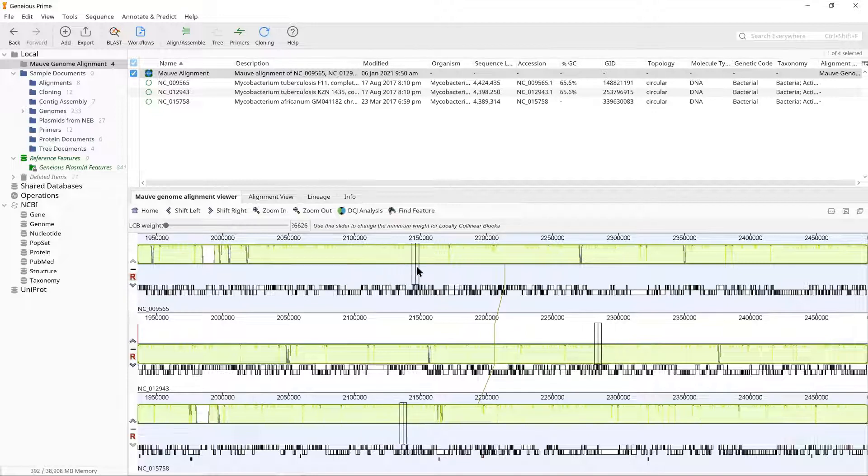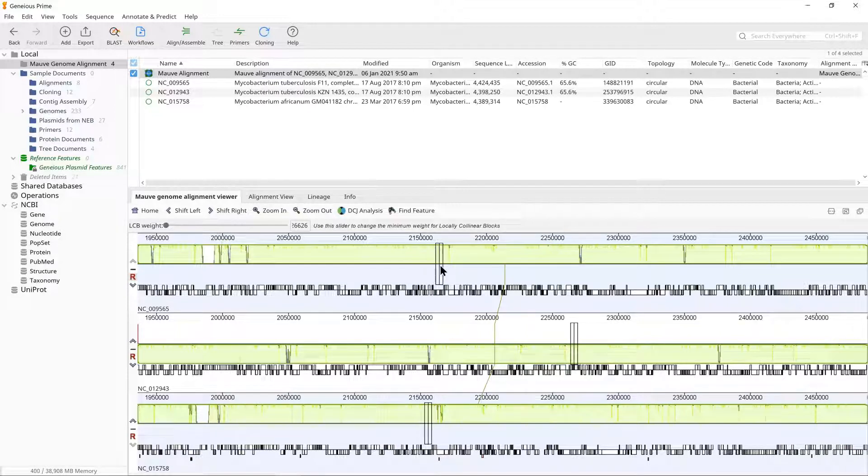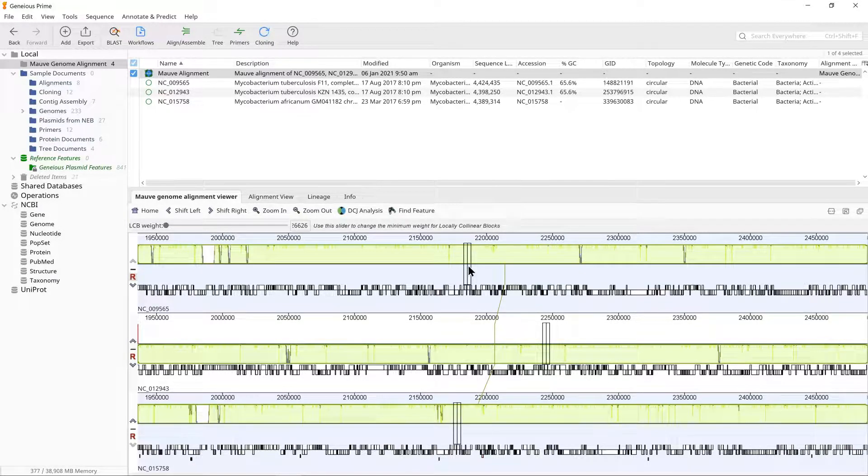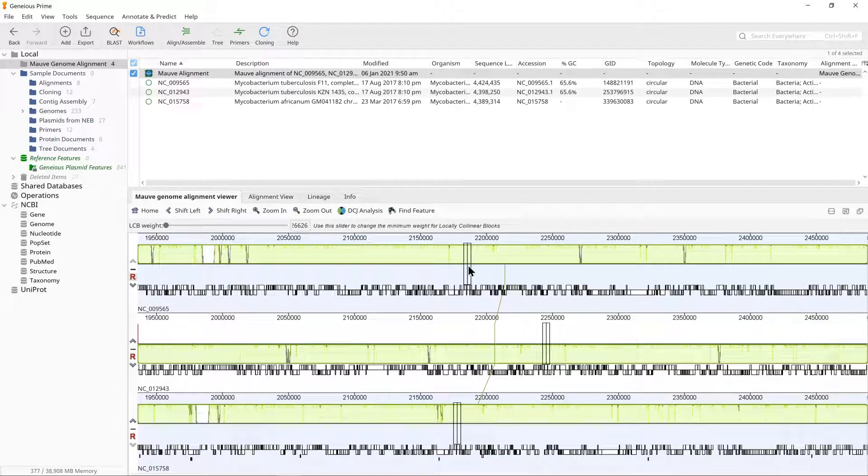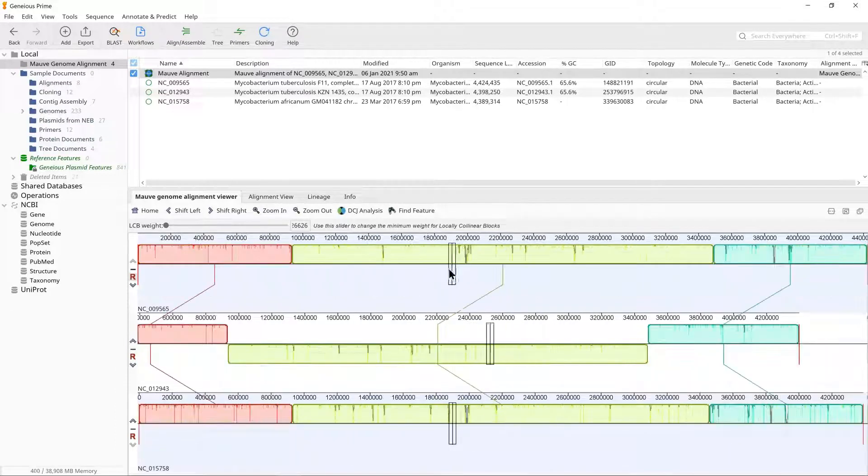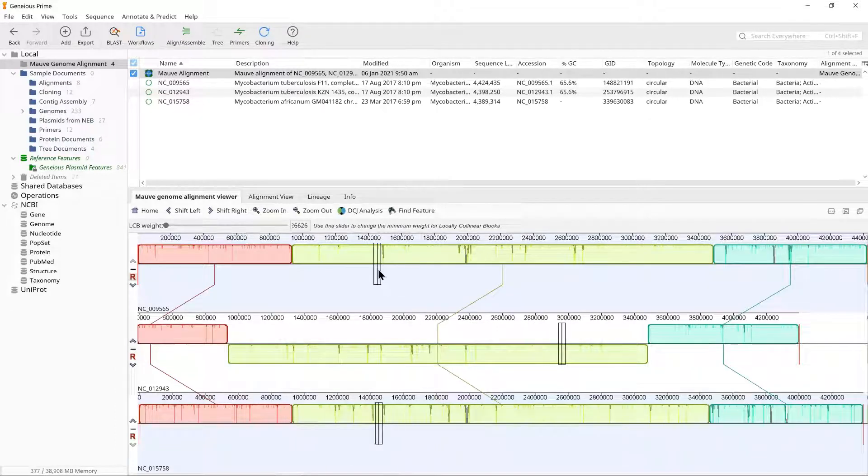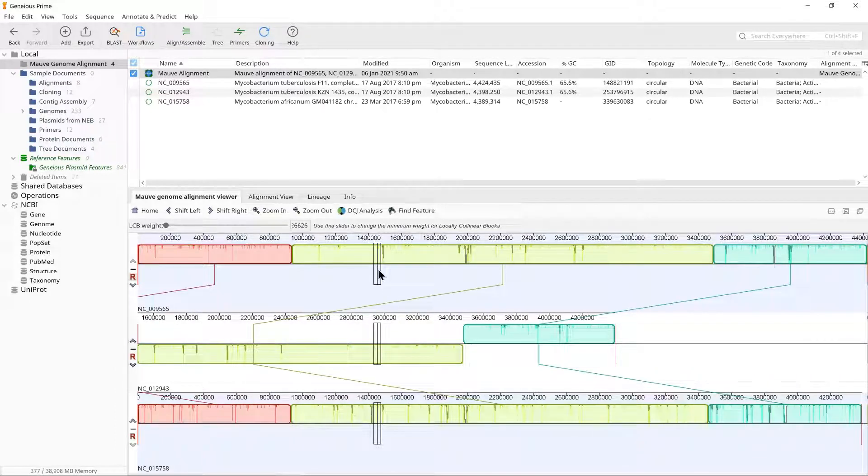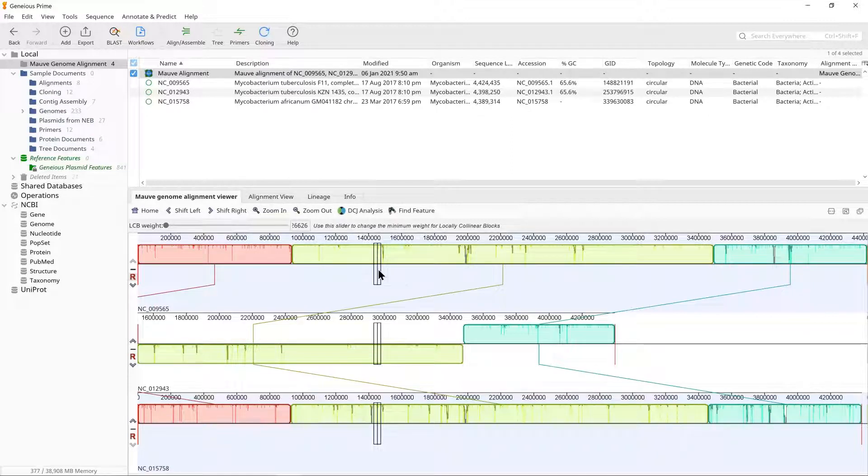As you mouse over the colored blocks on any sequence in the alignment, you will see rectangular boxes showing the aligned region in the other sequences. You can click on the alignment to center it on any given region. To reset the alignment view at any time, click the Home button.